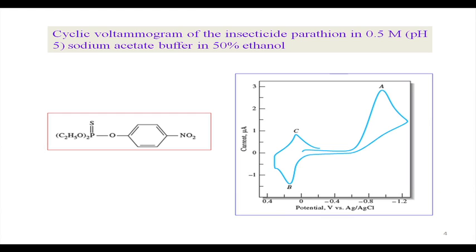Just now the ideal one we have seen, and we are discussing the ideal response for the standard reference material, which is your potassium ferricyanide, but this is not a very standard material. But with respect to that, because you can put that ferricyanide solution within it also, and you can scan that for your measurement.